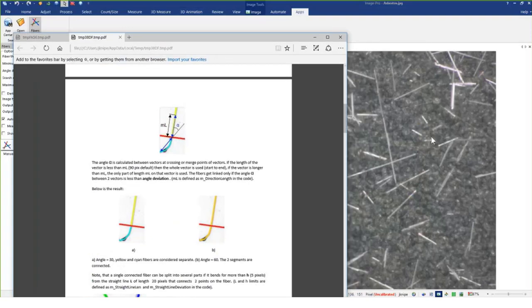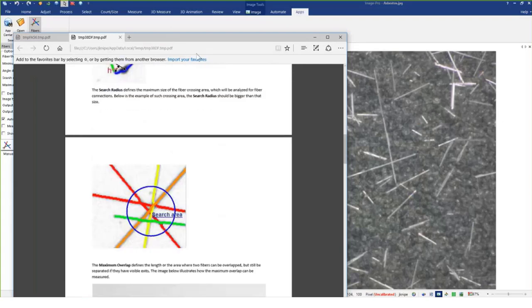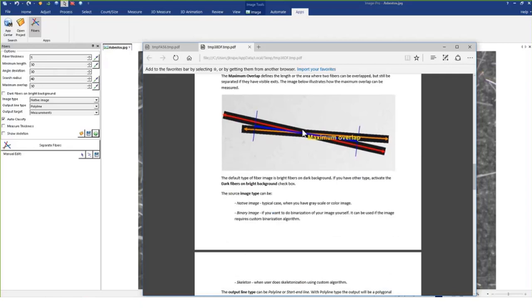If everything you're measuring is pretty much straight — matchstick-like — your angle of deviation is going to be small. Search area is the next parameter: where you have crossing fibers, ImagePro needs to determine what belongs to what as they cross. It defines how far to search out to find one end of the fiber and connect it to the next end, versus trailing off or curving around. This can be manually drawn on the image. The final parameter is overlap — if you have crossing fibers, how much can they overlap, again settable by pixels or by clicking on the eyedropper.